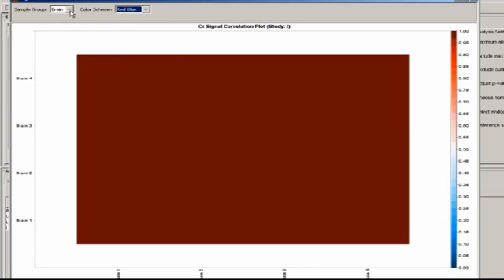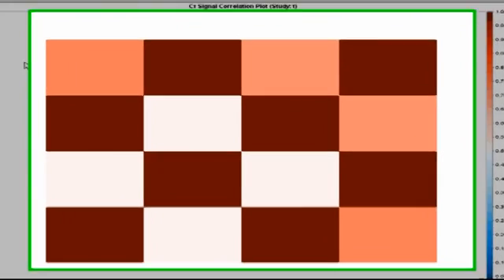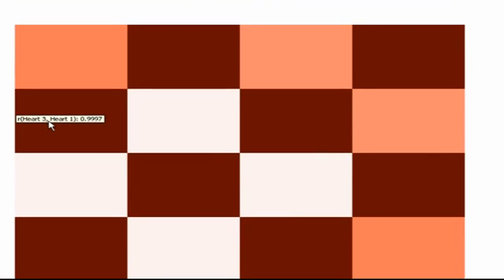You can see that the correlation is very high among all of our brain samples. However, heart shows a good bit of variation in signal. Note that you can mouse over, say, samples 1 and 3, and get an actual numerical measure of the correlation.